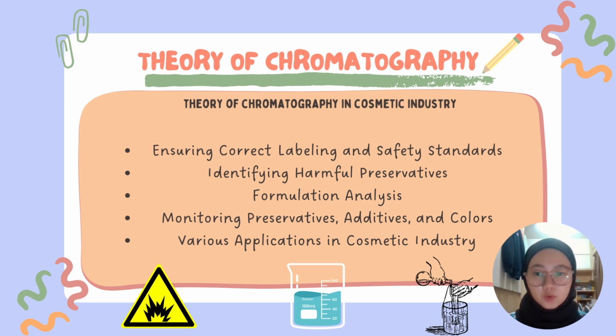You can check the formulations of cosmetic products to understand the elements and compounds used in them and their quantities, to make sure they follow all the necessary rules and regulations properly to ensure the safety of use for that particular product. You can monitor the preservative levels, use of additives, and colors that are used in the products. Thin layer chromatography can be used for a number of tasks, such as the analysis of sunscreen ingredients, the confirmation of the presence and concentration of UV filters for the best possible sun protection in the cosmetic industry, the analysis of complex lip product formulations, and the analysis of creams and lotion formulations.